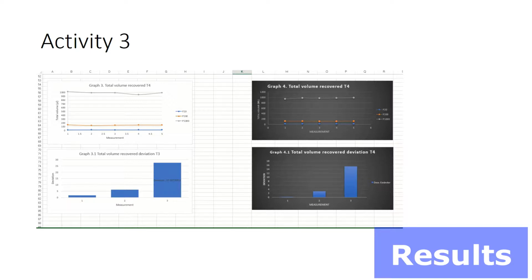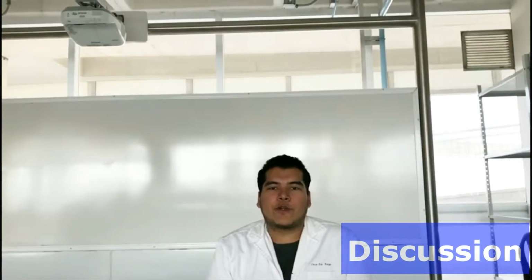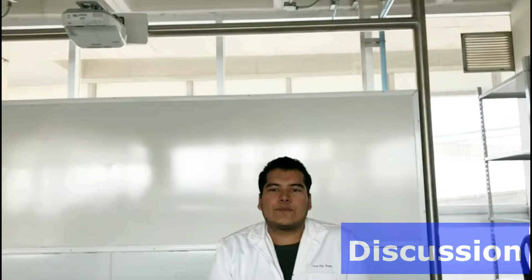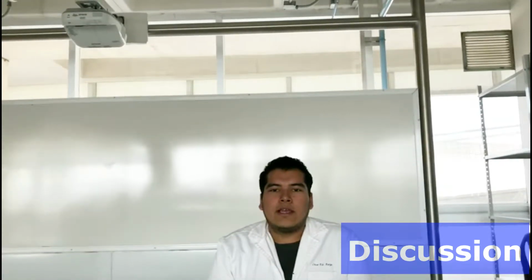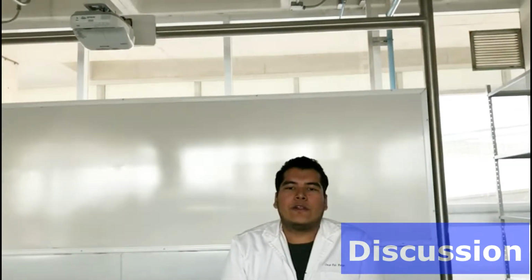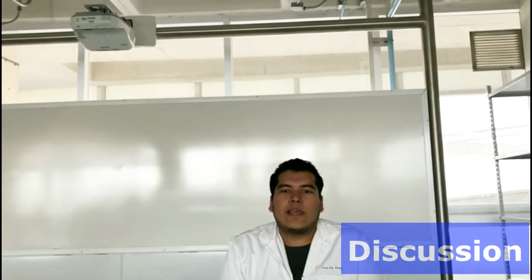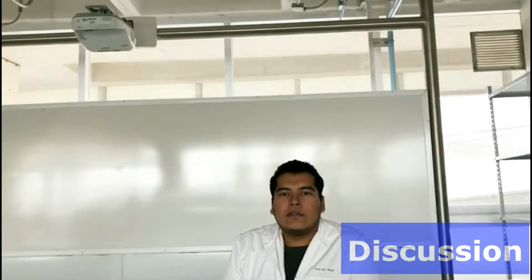on each team. In practice, the material and equipment used in the genetic engineering laboratory was identified, as well as its proper use, application, and location. Specifically, we worked with micropipettes of different measurement ranges and carried out measurements of different volumes in order to learn how to properly use the micropipettes P20, P200, and P1000.